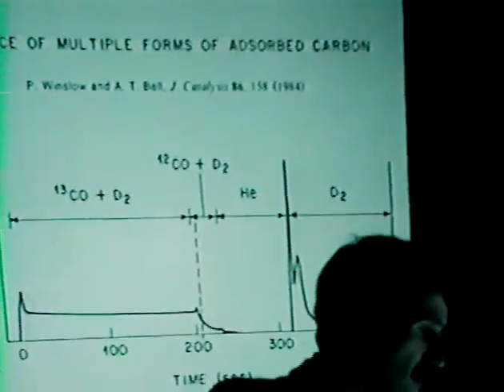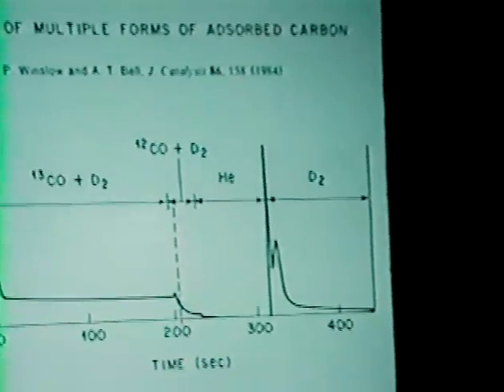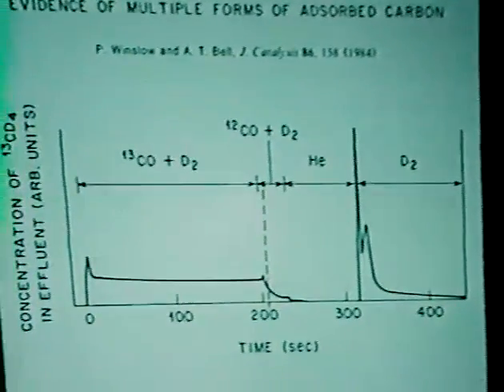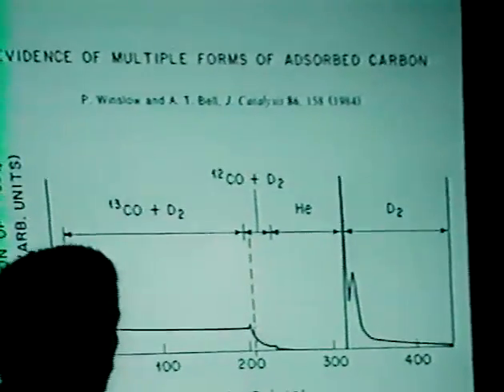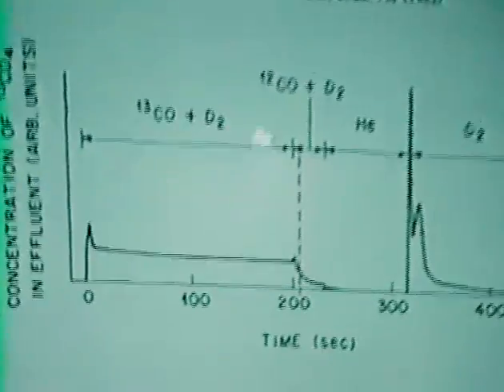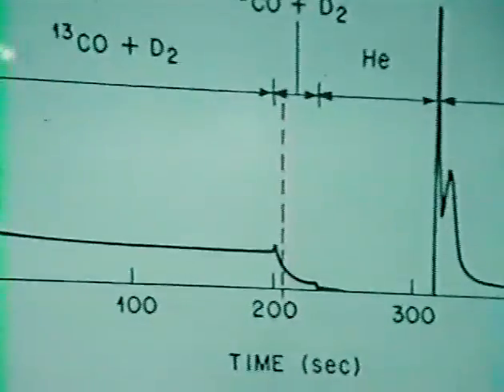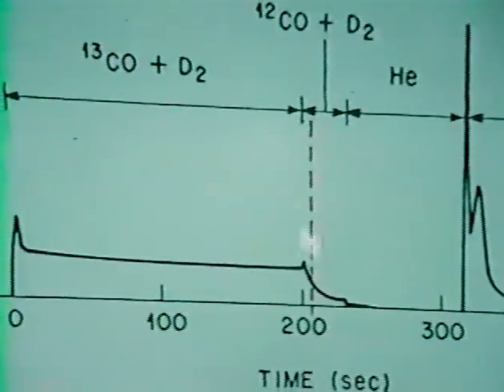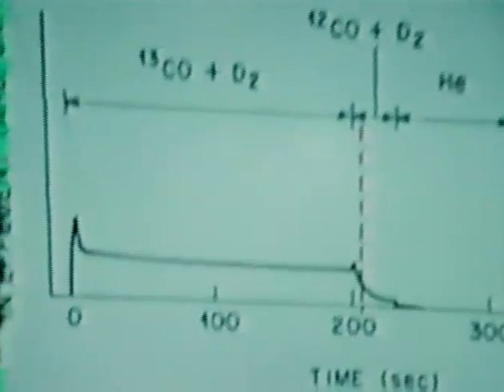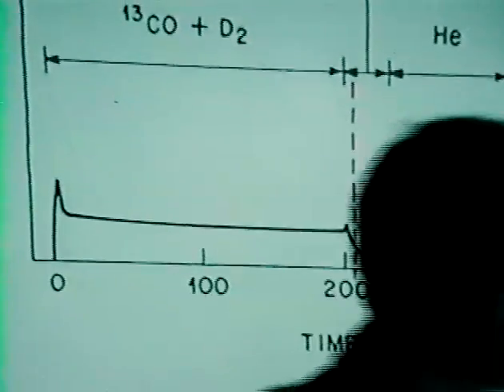Let me proceed now to the other species here, and that is the alkyls on the surface. As has been pointed out in a number of other studies, the alkyls dominate on the surface at steady state reactions. We have here the sample now quenched at a short time after steady state reaction so as to remove the carbon-13 from the oxygenated species, leaving now a representation of what the surface looks like at steady state.